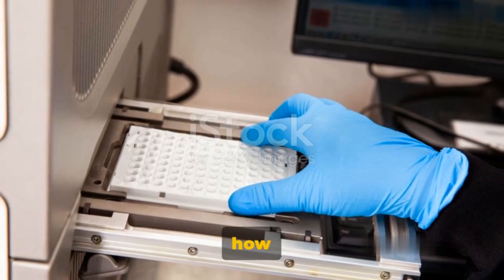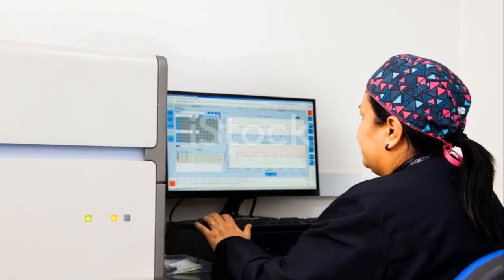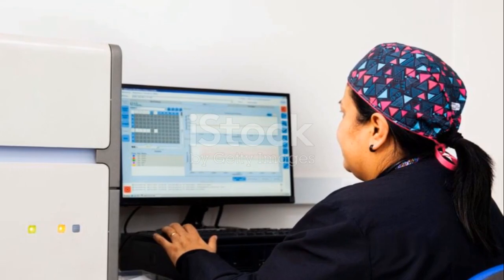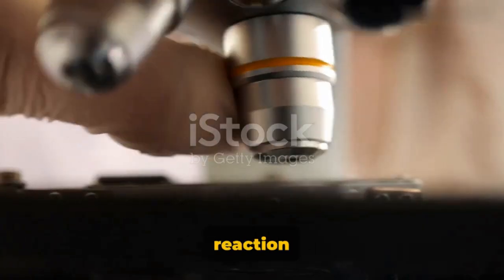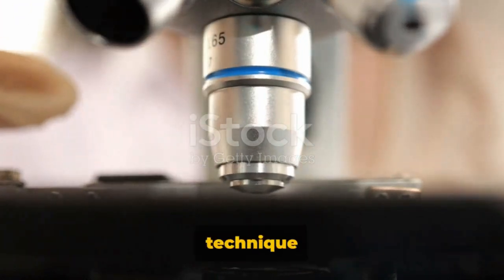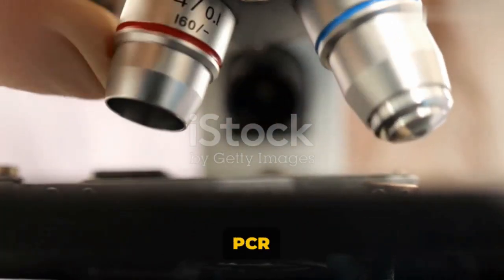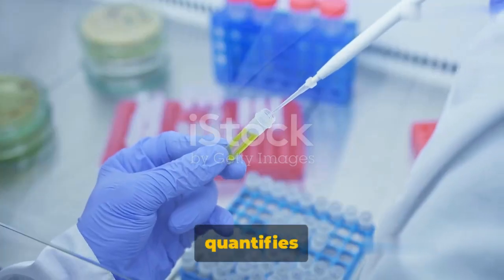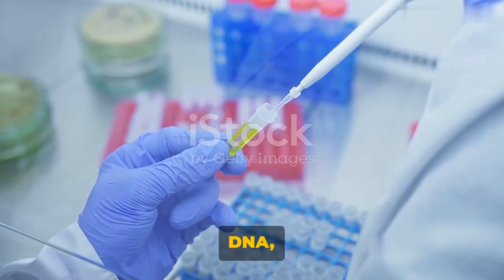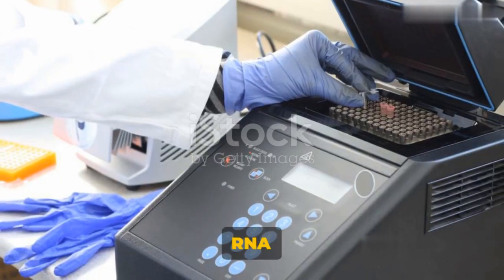Have you ever wondered how real-time PCR works? Well, let's delve into it. Real-time PCR, also known as quantitative polymerase chain reaction or qPCR, is a technique that monitors the progress of a PCR reaction as it occurs in real time. It quantifies a relatively small amount of DNA, cDNA, or RNA product.